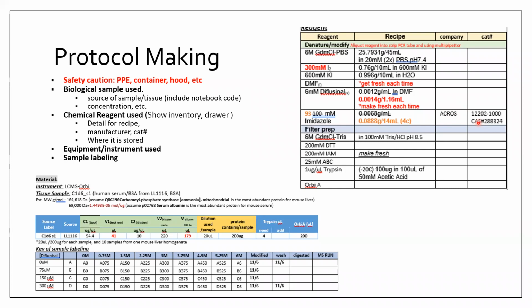And also when it comes to troubleshooting, when you have no idea what's going wrong, I hope that is not going to happen to any of you, but sometimes there's a problem with a reagent that is causing your problem. So just a story against here.